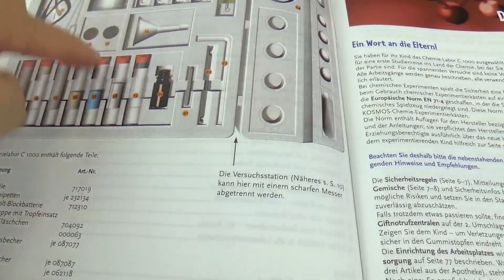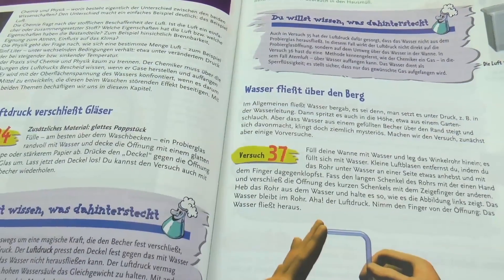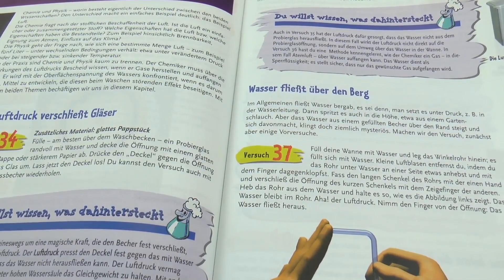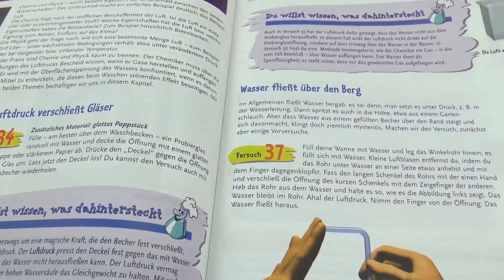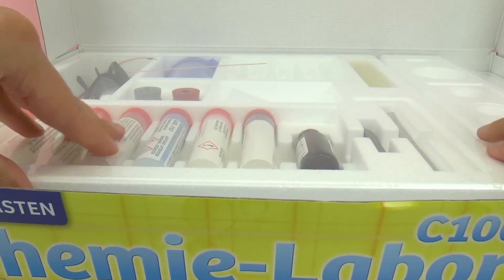Here we have a diagram of everything included. This is going to be pretty helpful, and if you keep everything organized, it'll definitely be very helpful to have this diagram. Here we have an example of an experiment, but let's go ahead and look at what else is inside the box.